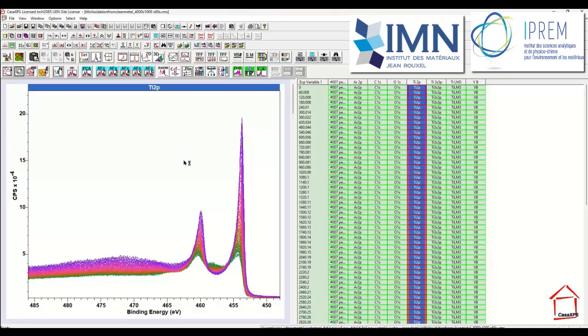The idea there being that we enhance signal and suppress noise by only using abstract factors that include signal, and they may also include some noise, but if we can identify all the abstract factors that are definitely noise and exclude them from the calculation, we will reduce the signal to noise problem within data.